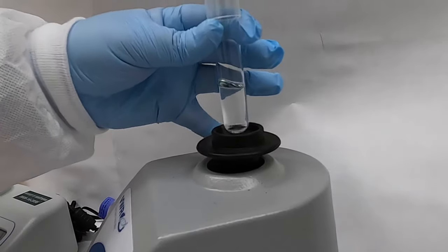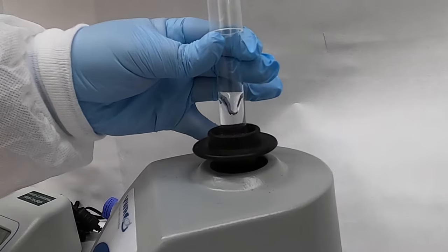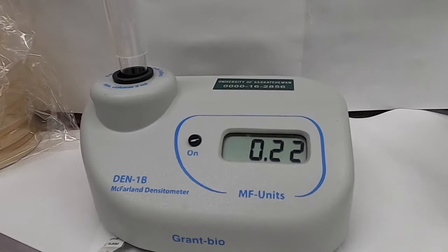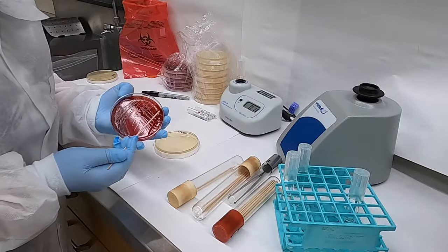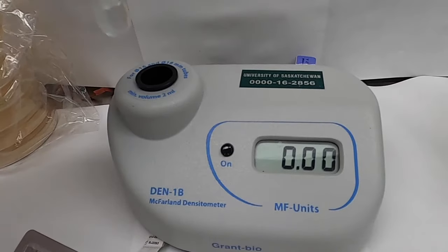We then vortex our tube to ensure that that suspension is as homogeneous and uniform as possible before measuring its density in the densitometer. What we're going for is a suspension with a density of McFarland 0.5, and in this case we needed to add just a few more bacteria, which is totally fine.